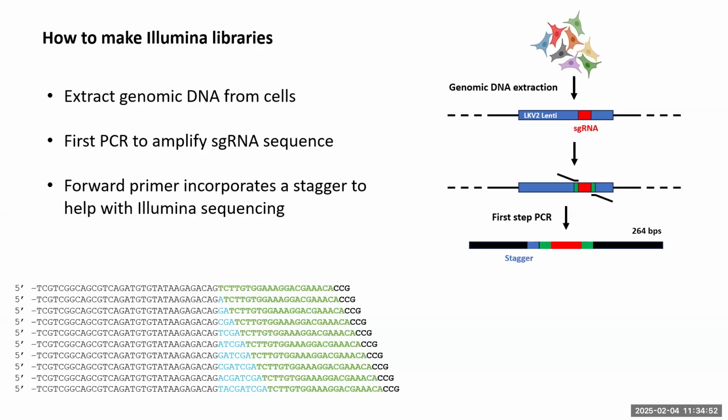It's to do with when you're doing the sequencing with Illumina, and you have essentially your stepwise process where you add a nucleotide and it's fluorescent, and the machine reads the fluorescence. If every sequence right at the start is the same sequence, the whole plate ends up with the same fluorescence, and it sends the machine off a bit. It doesn't like reading the same color all at the same time because you get massive bleed through.